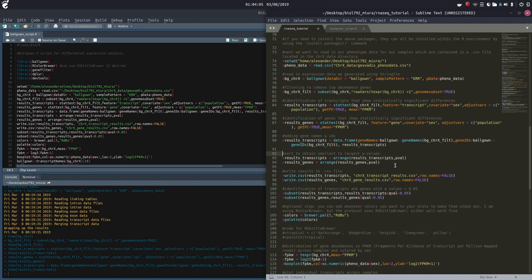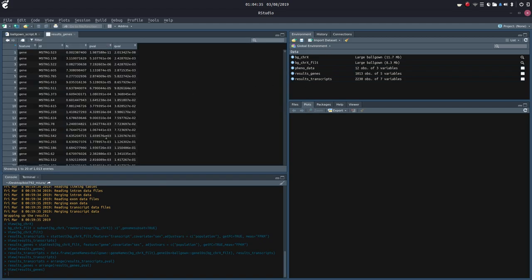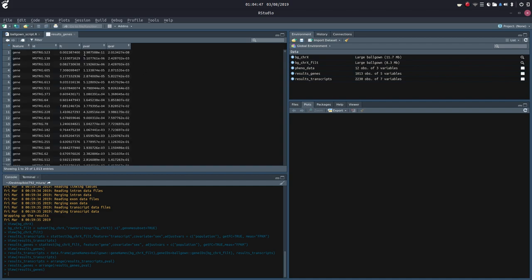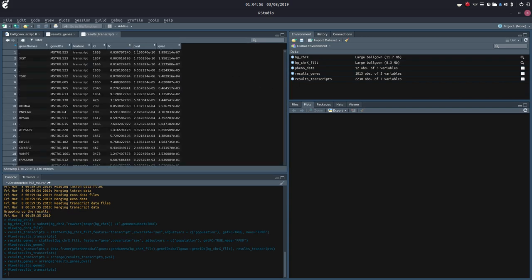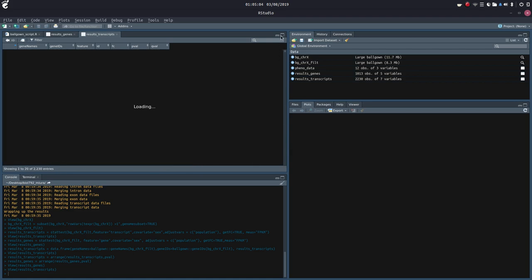Now we're going to sort these results_transcripts and results_genes to obtain smallest to largest p-values. Using the results_transcripts environment variable, we're going to arrange results_transcripts by p-values, as well as results_genes. P-values are now arranged from smallest to largest. We can see 0.99 is the largest and 1.98 times 10 to the minus 11 is the smallest. And for our transcripts, 1.23 times 10 to the minus 10 is the smallest and 0.9998 is the largest.